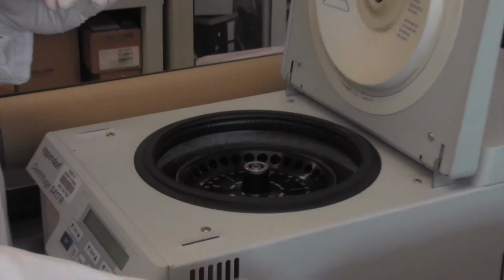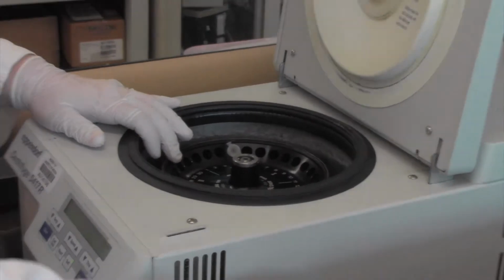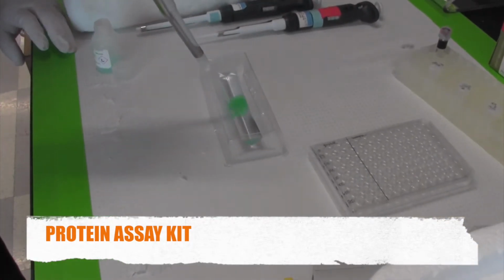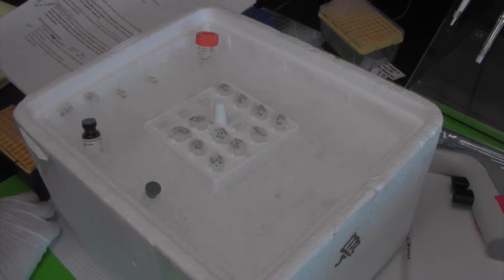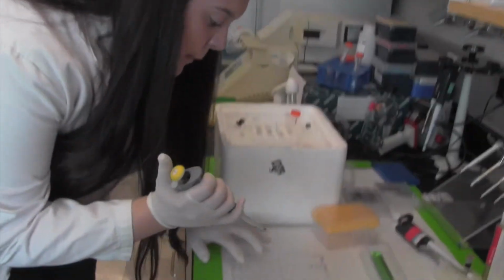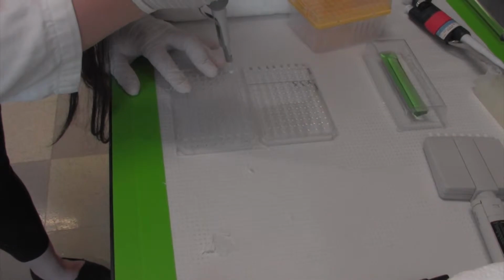Our test tubes are centrifuged for 10 minutes to get the samples ready for measuring their protein concentration. We then mix our BCA protein assay kit. We then begin loading the samples in by triplicates and proceed to add protein assay reagent to all the wells containing the samples.